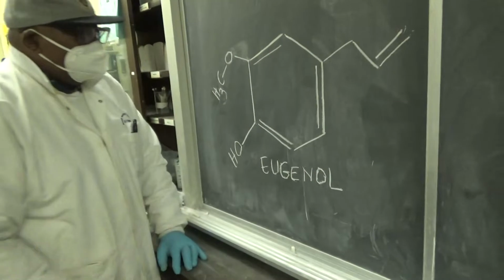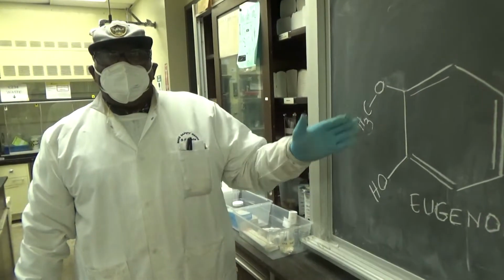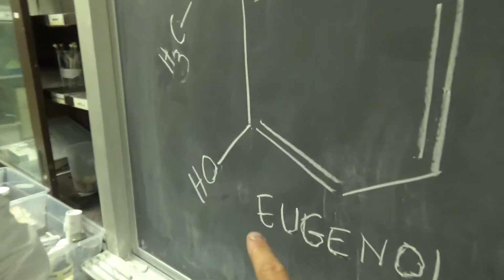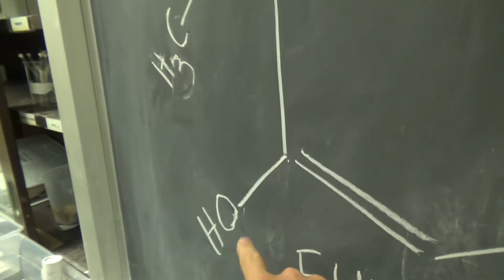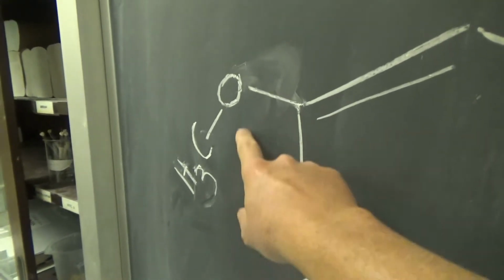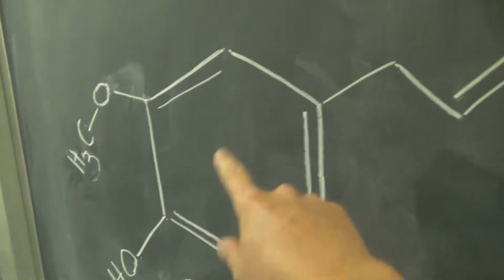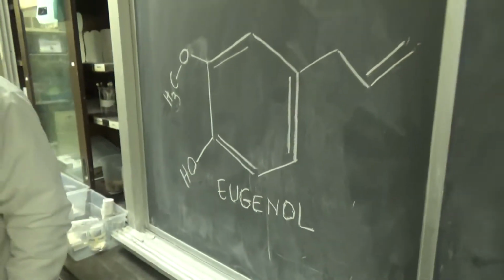So that's eugenol, the molecule that's being isolated from steam distillation of the cloves. The students should know what the functional group names are for that. We did that in class. And they should also know what the ring is called, and also what this weird thing over here is. They should know all that stuff.